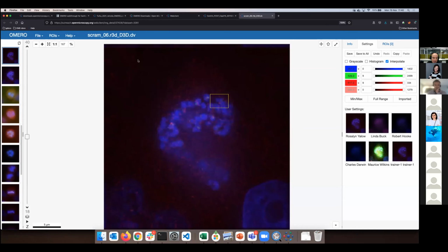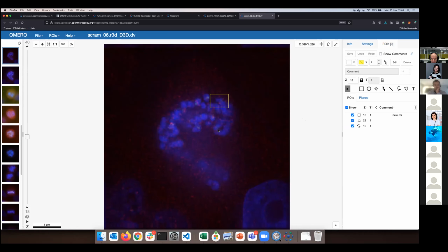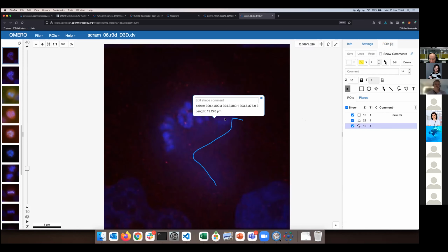And I will now go back to iViewer and show the very popular feature of iViewer, where you can view more images. So first of all, as the ROI is obviously quite important for you guys, let me show you what about this lock here. This polyline is on plane 10, but if I click and unlock this lock on the Z, I can have the ROI which hovers over all planes.